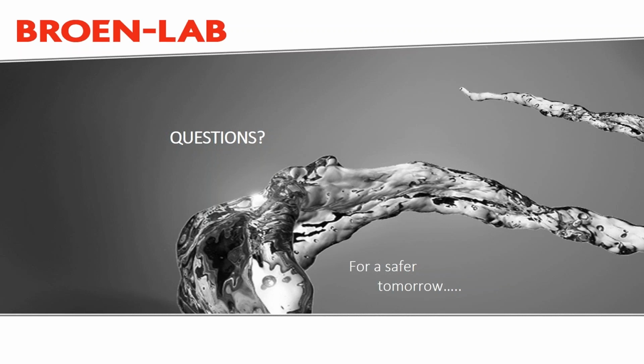Well, it's going to be the local EH&S personnel who set the standards for the campus. That's why you have an adjustable thermostat on it, because they'll tell you what it should be set at. I've seen applications where they set it at 75 Fahrenheit, and some where they set it at 90. That's going to be at the high end. So it's going to be local jurisdictions. Okay, so it's a local issue.